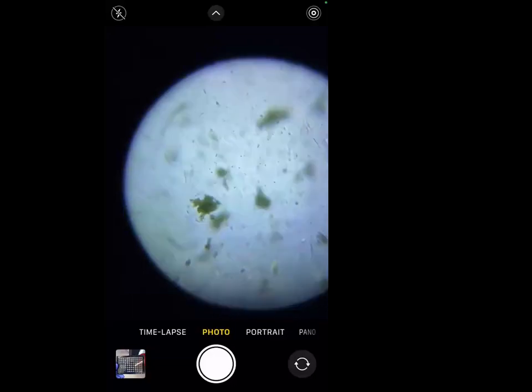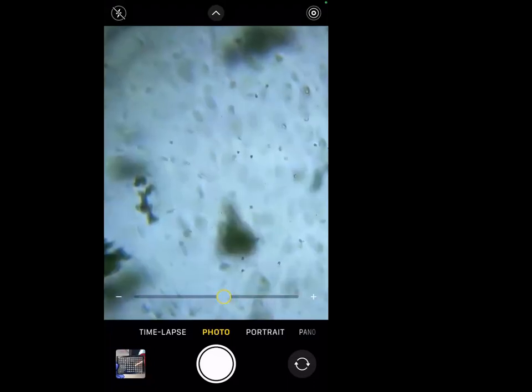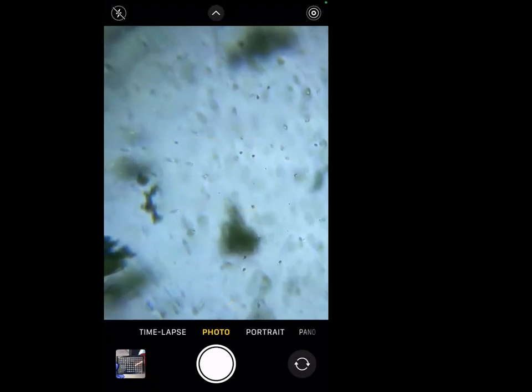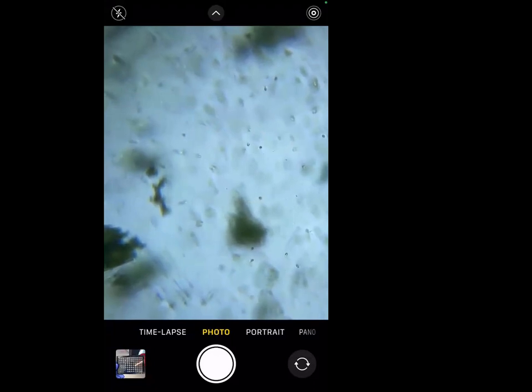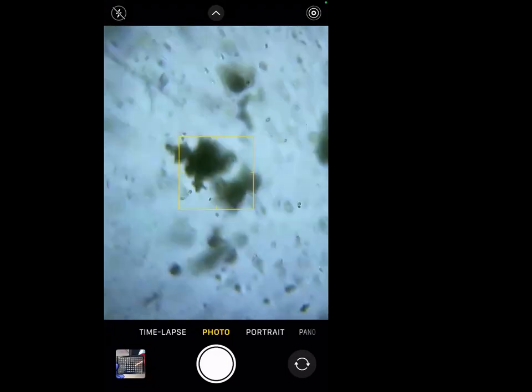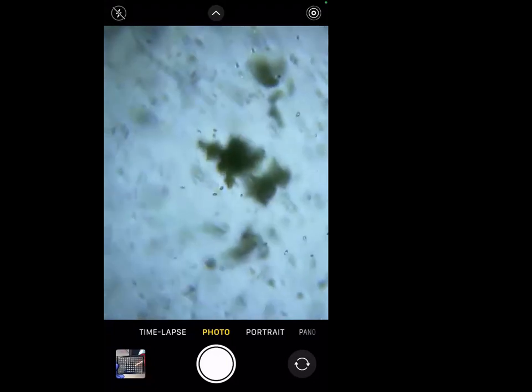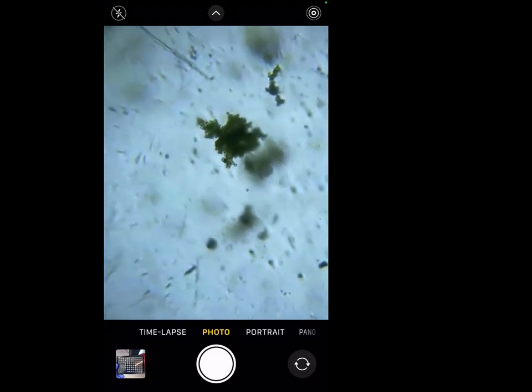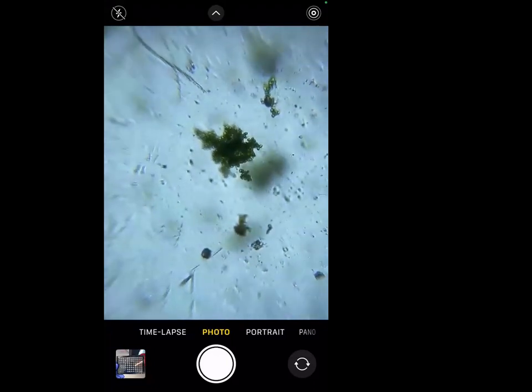Usually when you pick up a sample like that, you also see things that move within the sample. But let's see if there's anything that is moving. Okay, there is something that I can see moving. Yeah, there are things, paramecium. So there are things that are moving, but we are more interested in the algae here, right? What I'll do right now is change the focus so that we can focus on the algae to find out, is it circular, globular, or filamentous, whatever.